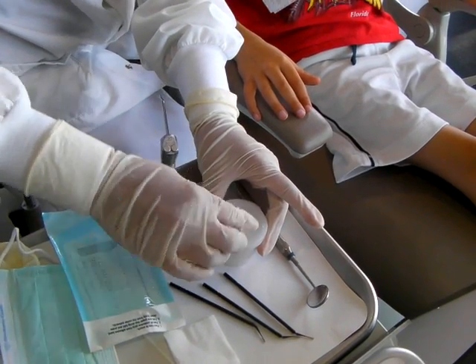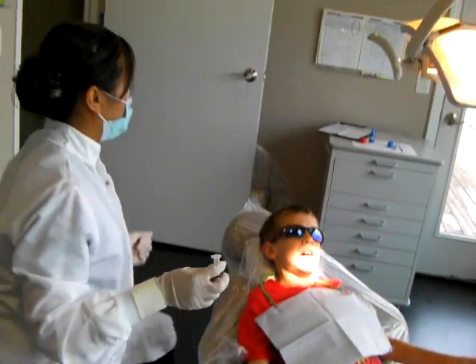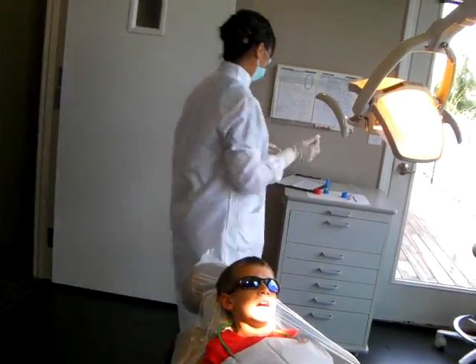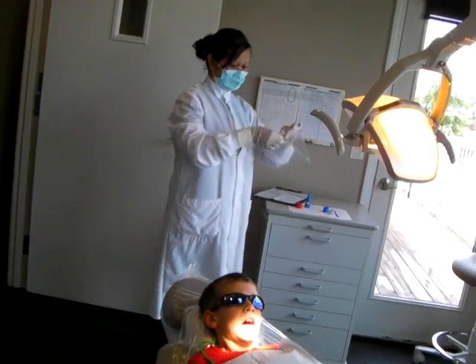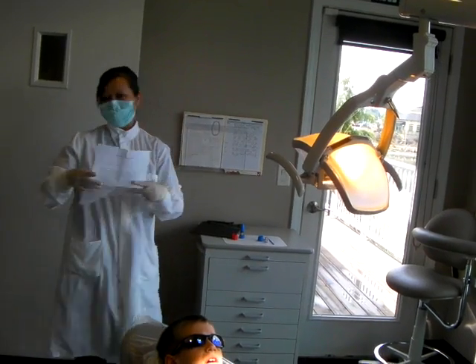Close the lid to the buffering solution and we're going to place it back in the baggie with the consent form and put it in the freezer.